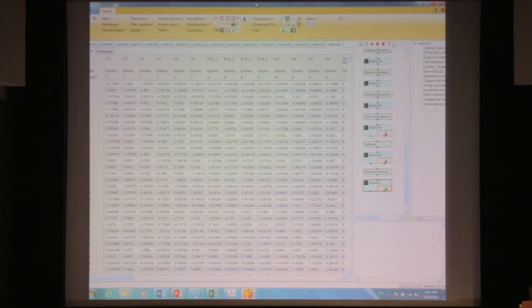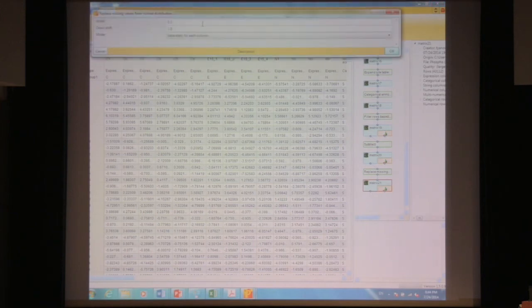In principle, yes, but there's a big danger if you use information from your data for imputation, because if you then go on and use other statistical tools on that imputed data, where you already used a lot of information, you're bound to overestimate p-values, significances, and so on. The best example is if you have a two-group situation, and you use the grouping information when you impute. You can do that, and of course the data looks much better. But if you now calculate t-test p-values on this, they will be completely wrong. So it is very dangerous if you use information from the experimental design in the imputation.